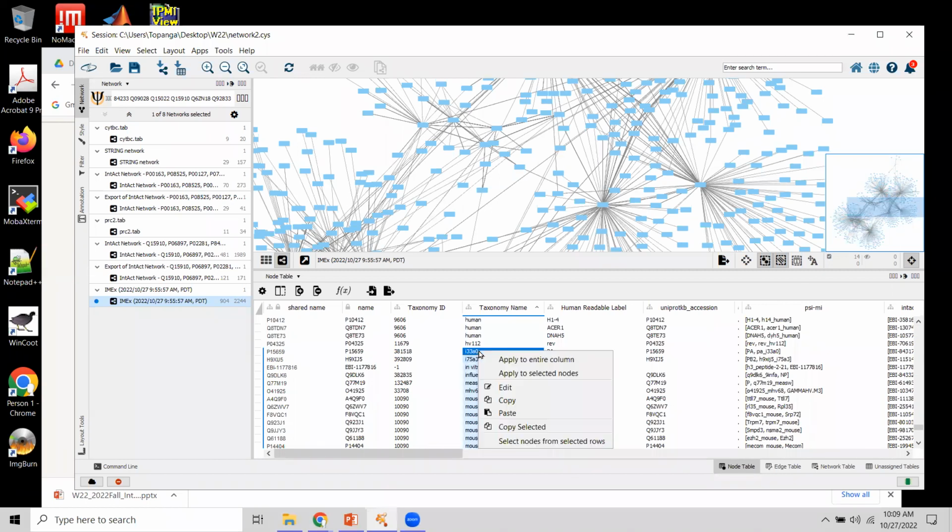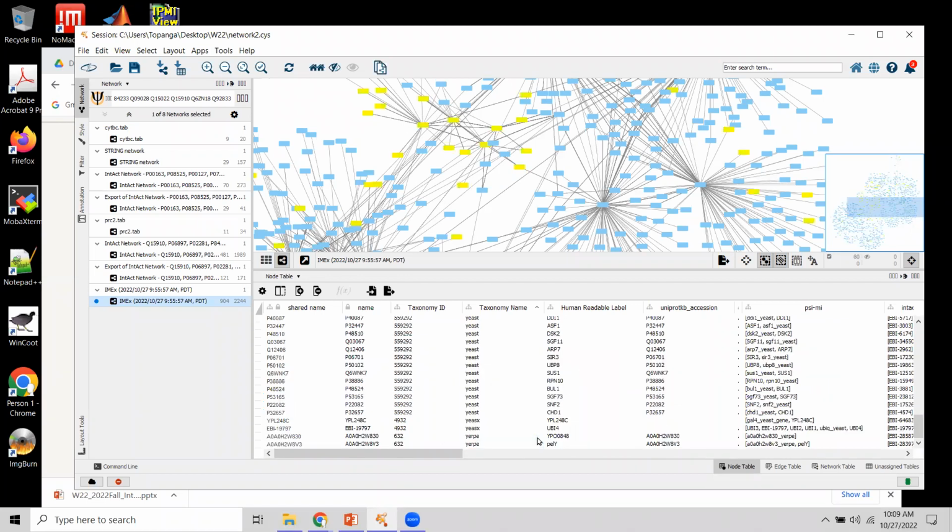Here, do select, and then whatever is selected in terms of nodes and edges, there's a counter here telling you that we've got 80 proteins selected. So we're losing about 10% of the proteins, including whatever we had before.